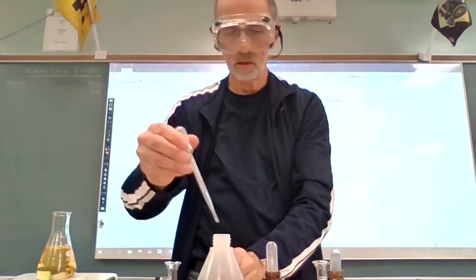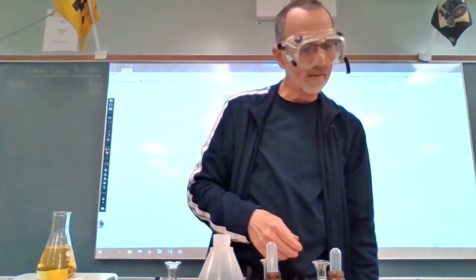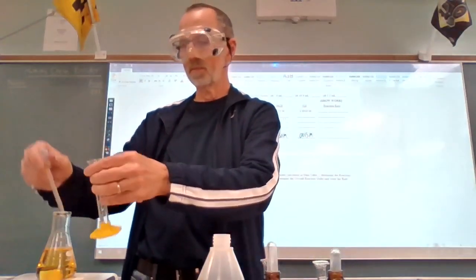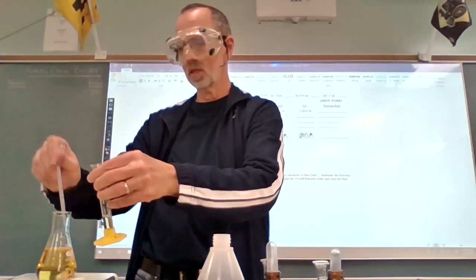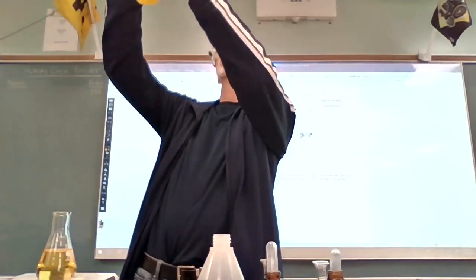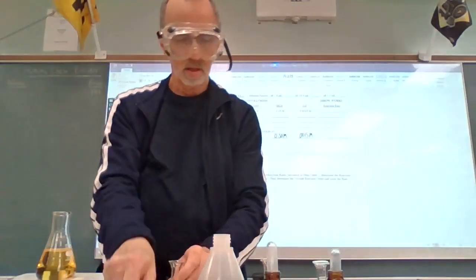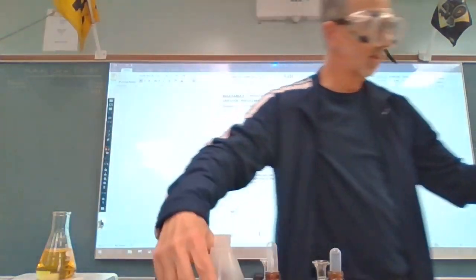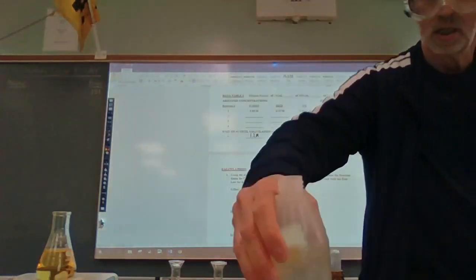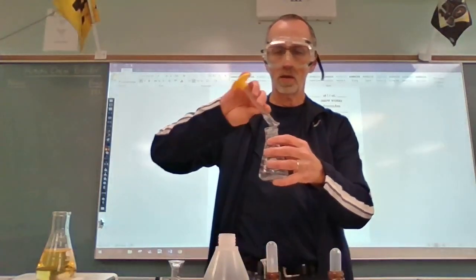There we go. And 7.5 of iodine. There we go. Okay, rinse this out real quick. Put in my first 3 reactants.